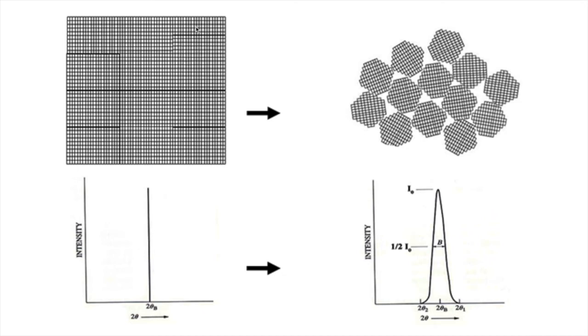So let's say I have one large crystal. So what you see here, it's a continuous crystal structure that is one crystal. So this big square, right? It's all one crystal. So if I measured the length from side to side, that would be one distance, right?